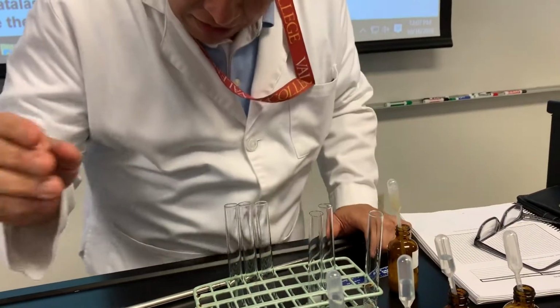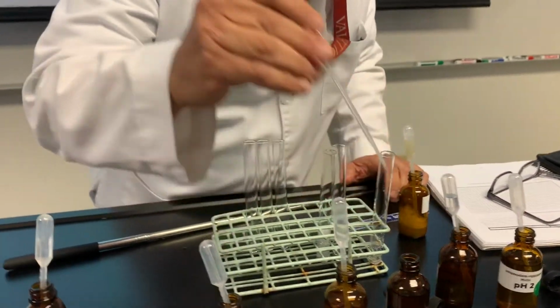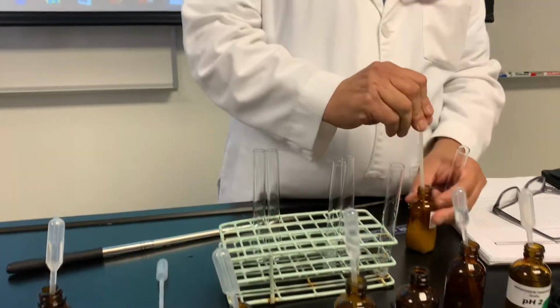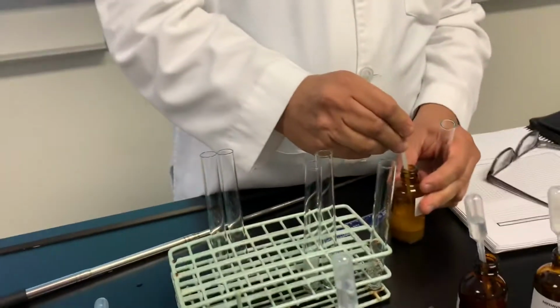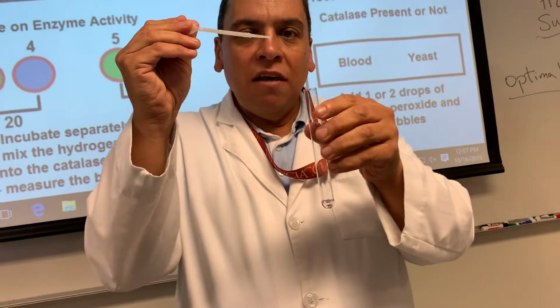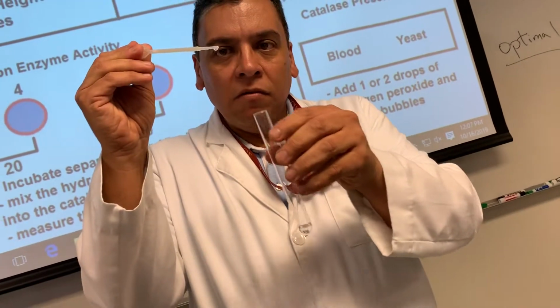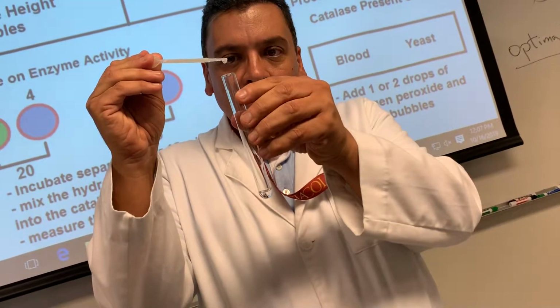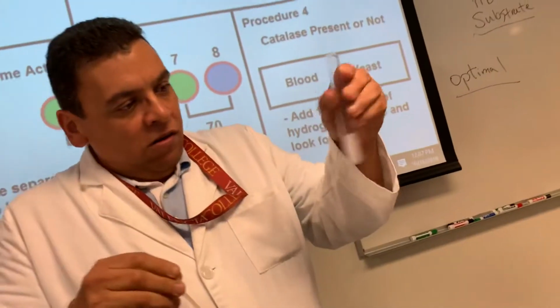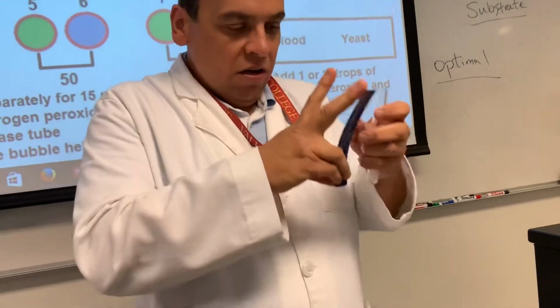It fell on the side. Reroll? That's cheap. Reroll. No. Was that one just water? Let me try it again. This is the 7, right? That's water, right? No, that's hydrogen peroxide, pH 7. I won my bet and then they got a reroll. Cheating, man. Yeah, when it hits the side, it doesn't work well, of course.